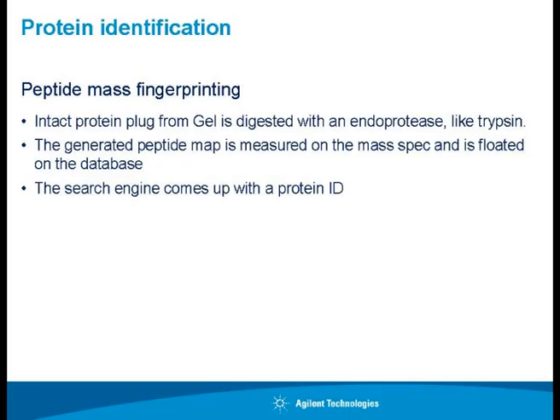For protein identification, what we typically follow is the bottom up approach. I'll come to that. With peptide mass fingerprinting, you digest a protein with some protease, you get small peptides, and you trigger an MSMS of the small peptides, fragmenting them again. So you've broken down the protein into small pieces, collate it together and submit it. That is bottom up. You are taking everything together and submitting it to a database. You have started with some mass number, you have fragmented that into another group of mass numbers, you submit it to a database and get a name, what exactly it is. That is what it is.